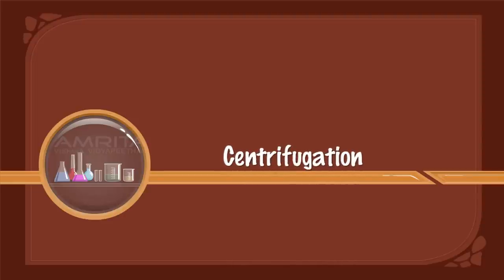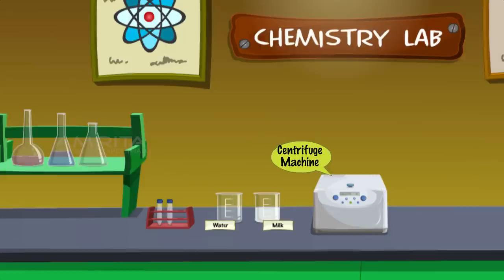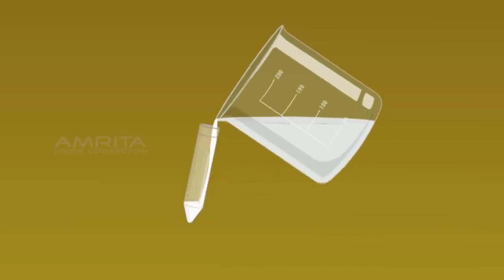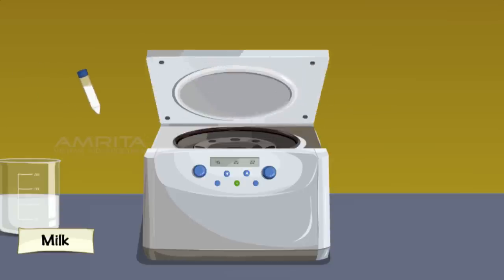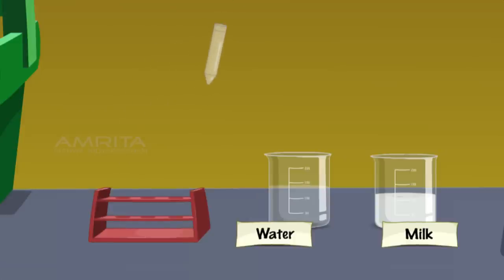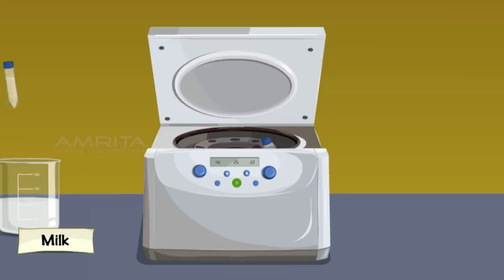Centrifugation. We require milk, distilled water, centrifuge tubes, and a centrifuge machine. Take a centrifuge tube and fill three-quarters of it with milk. Place the centrifuge tube in one of the holes of the rotor of the centrifuge machine. Take another centrifuge tube and fill three-quarters of it with distilled water. Place it opposite to the first centrifuge tube to balance the centrifuge machine.